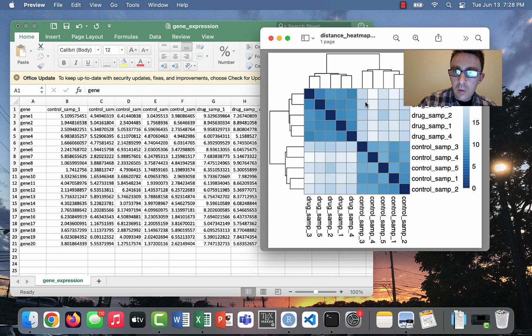So I'm just going to show you how to do this in R. It's going to be a pretty quick video, but again, hopefully useful for you guys.